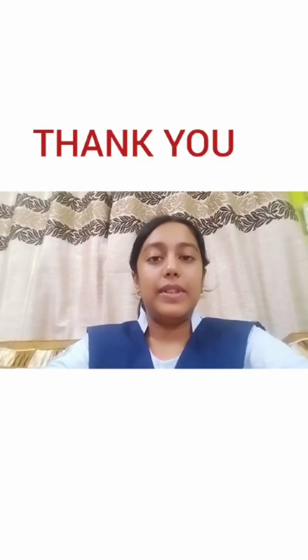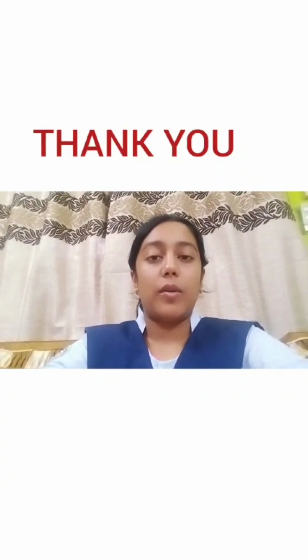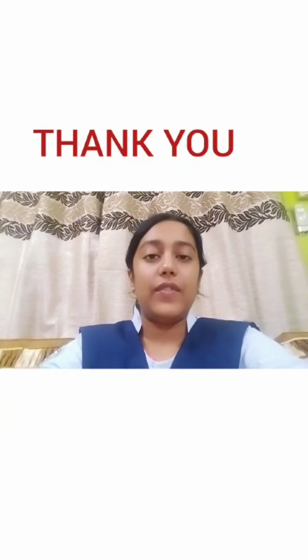Now I will keep this setup for 7 days and observe the mortality rate of rice weevils after every 24 hours. So here my setup is ready. Thank you.